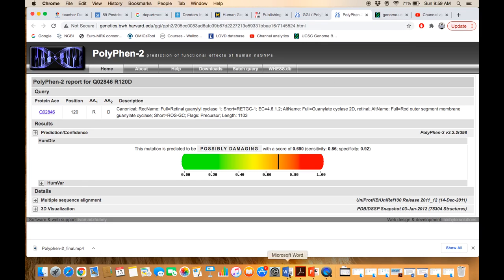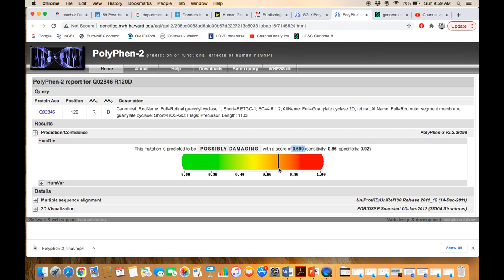Now we have a result page with a graphical representation. This mutation is predicted to be possibly damaging, and its probability score is 0.690. In the graphical form, the buffer zones show that the score is a little bit apart, more towards the danger zone.